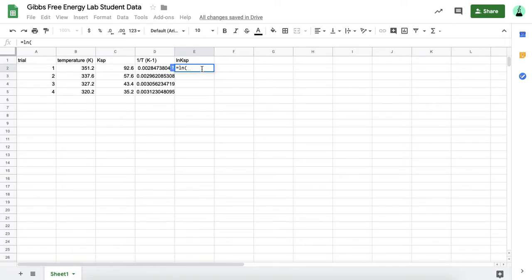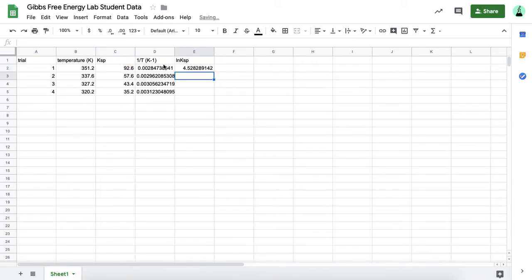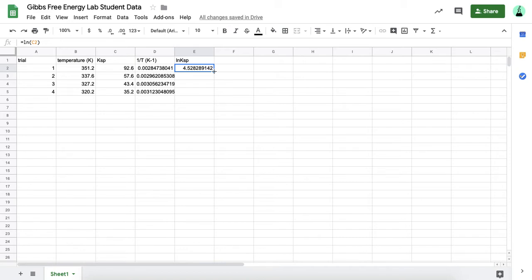What I want to take the natural log of is my solubility product constant here that I calculated. Close your parentheses, hit enter, and it'll calculate that for you. Then I'm going to do the same trick here to do the other three trials. I'm going to hover over to the bottom right corner where I get the crosshairs, click and drag for all four trials, and then I have all the values.